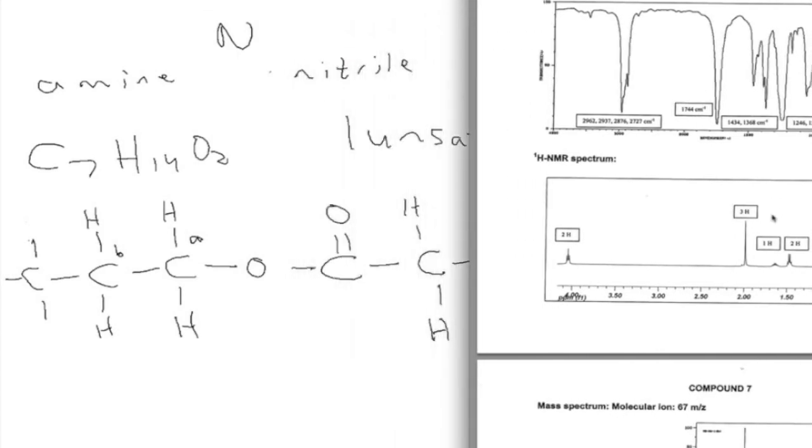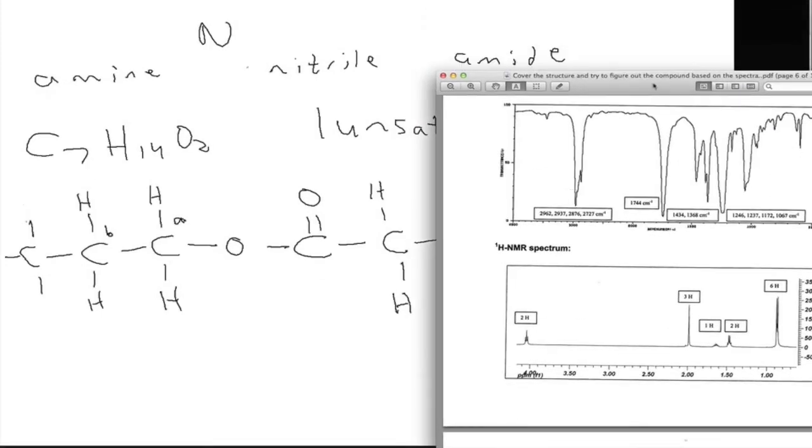That's right. This is something that really should have jumped out at us here. Singlets are very helpful because there's not that many ways to get a singlet. When you saw this was a singlet, that should have been a strong clue that this methyl group was attached to the carbonyl. If you see what I'm saying? Because how else could it be a singlet? Otherwise it would be very difficult to end up with a singlet. So I don't think that was something that we were getting in our earlier pictures. That's important here.